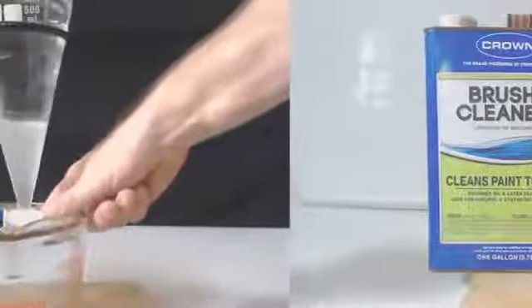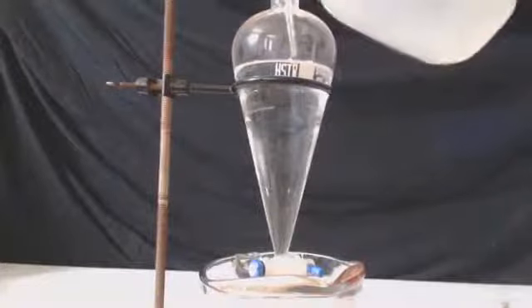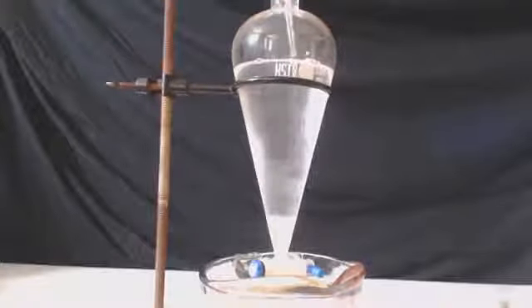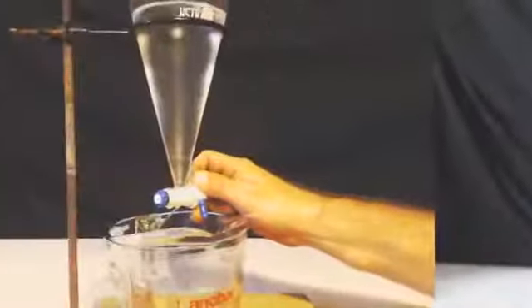The bottom layer is going to be the water. I'm going to drain it out, and hopefully it'll have all the alcohol and polar stuff in it. I'm going to do this a second time. Pour the water in, just a little bit. See, I'm just putting a little in there. There isn't that much polar stuff in there. I'm going to shake it up, let it sit 20-30 minutes. Drain out the bottom layer.